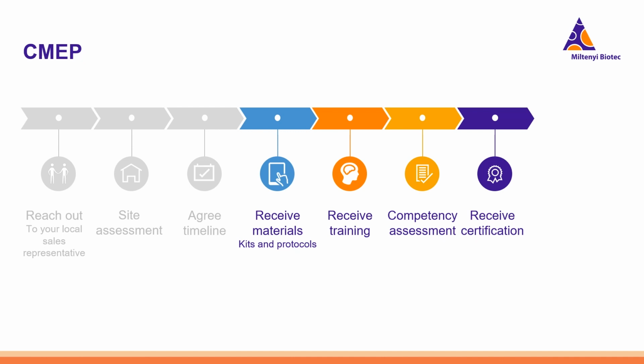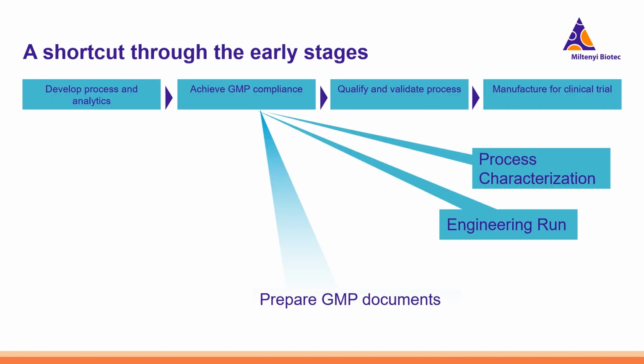And hopefully, once the staff have passed, we will again issue a certificate, and you will receive certification for the staff that they have been properly trained to run the process, and that they are capable of doing the process themselves. The ultimate goal is to bring you to the point where you don't really need to do any process development and where you have successfully transferred the protocol to your site.